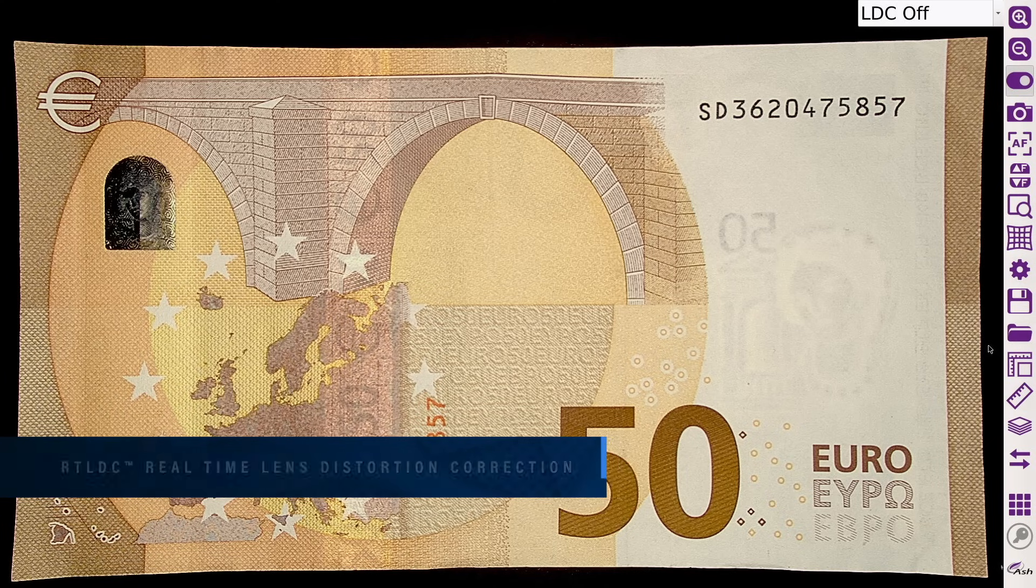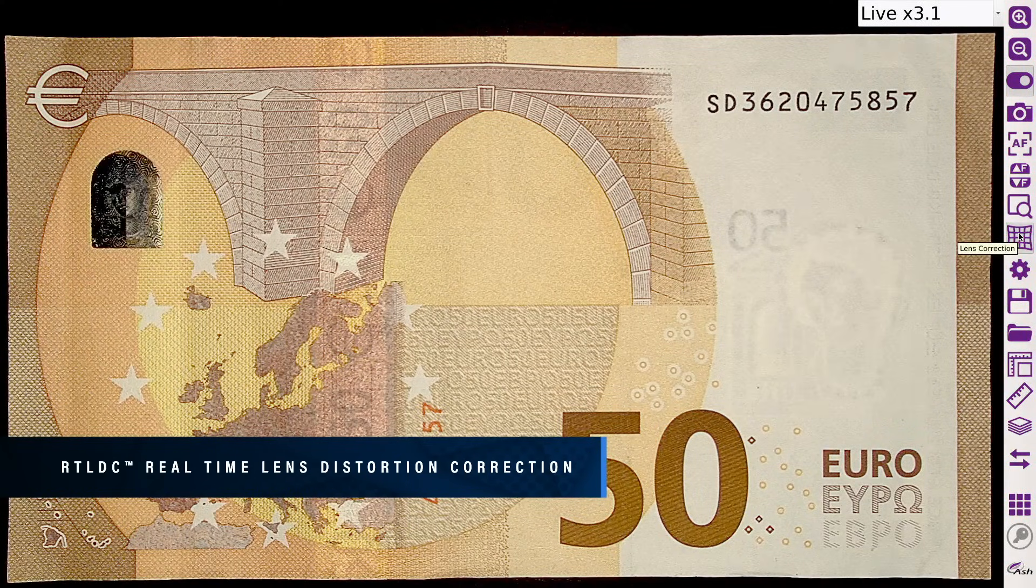Omni 3 incorporates unique real time lens distortion correction utilizing our new AshCam Plus. Allowing inspection of a true, undistorted representation of your sample.